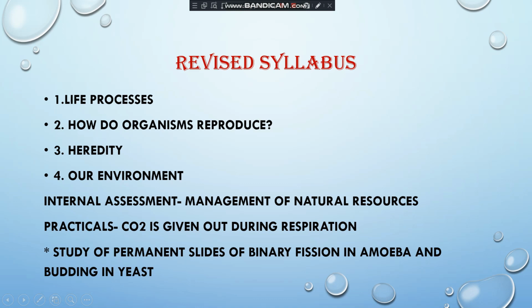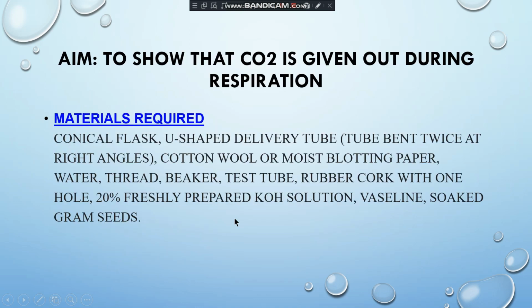Now today's practical, that is to show that carbon dioxide is given out during the respiration. And students, you have to write this practical in your practical notebook. Okay, similar way, first you have to write the aim, then you have to write the materials required. So what is the aim? To show that the carbon dioxide is given out during the respiration.